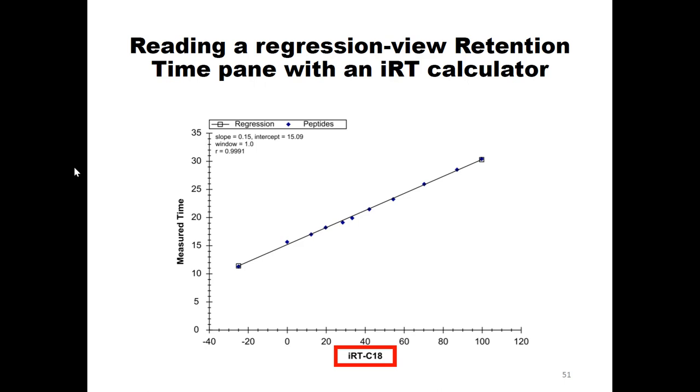Yes? How many anchors is realistic? Most people use 10-ish anchors. At the barest minimum, you could get away with two. Two points describe a line, but obviously more is better. I see most people doing about 10.